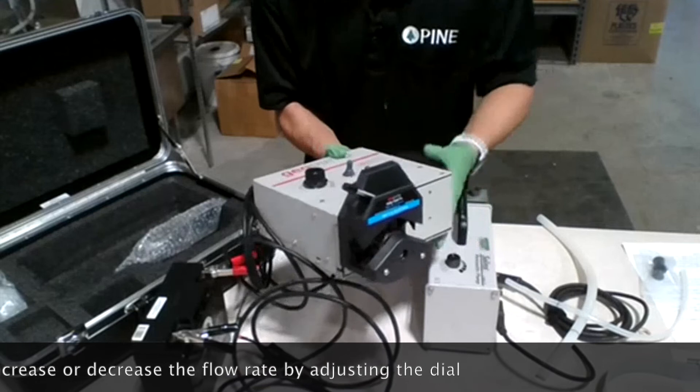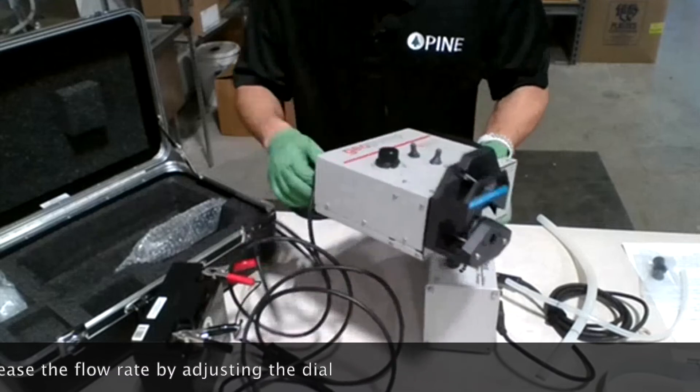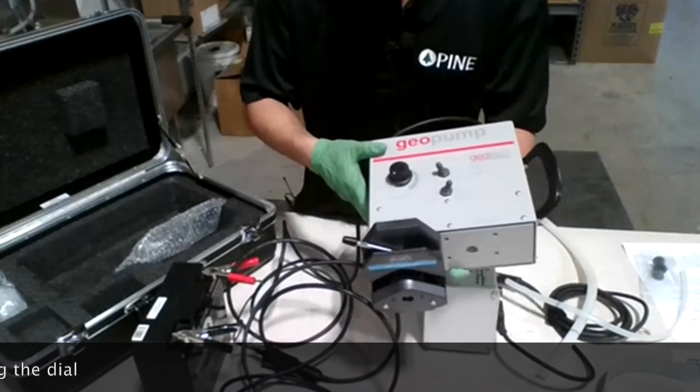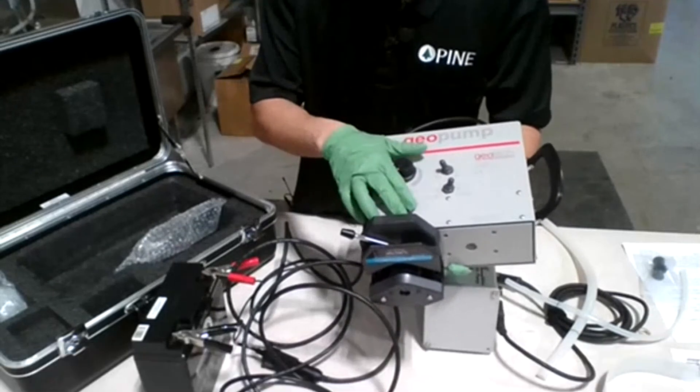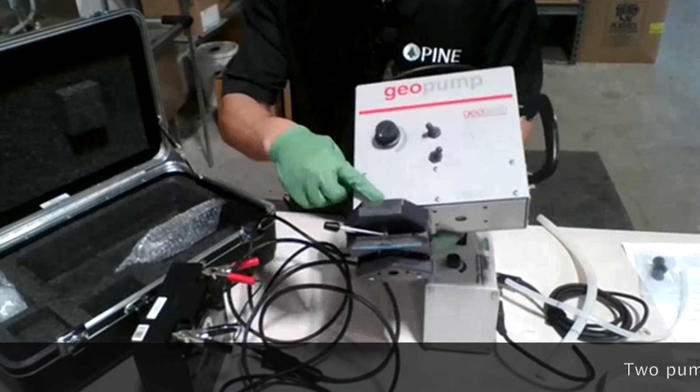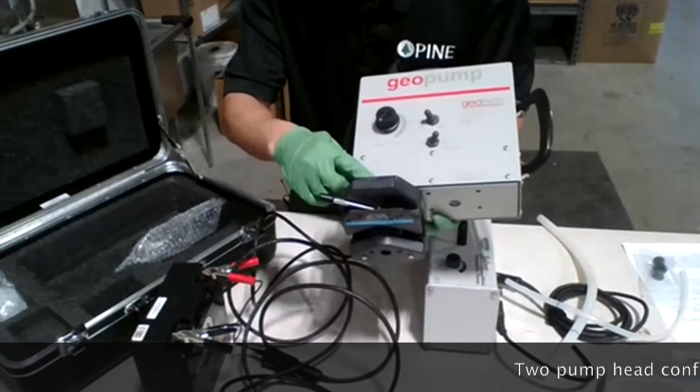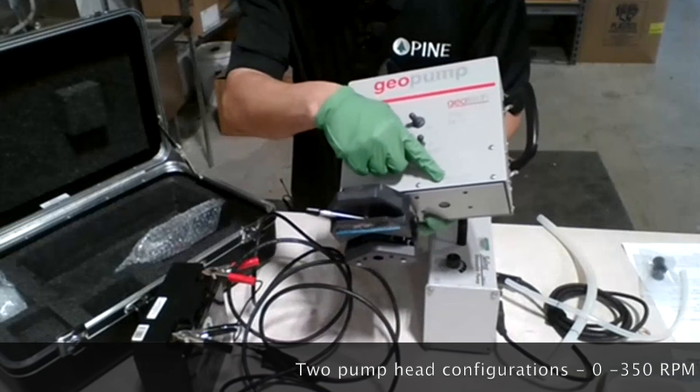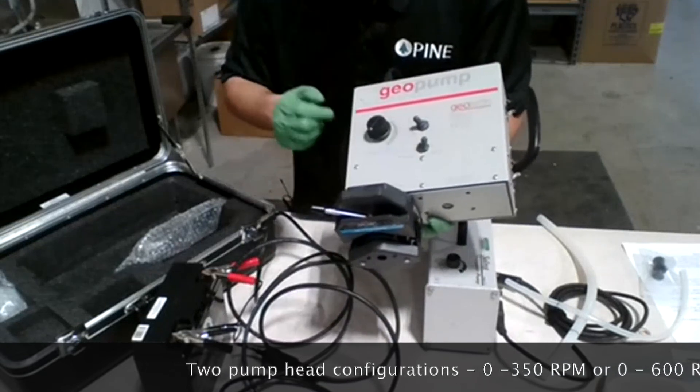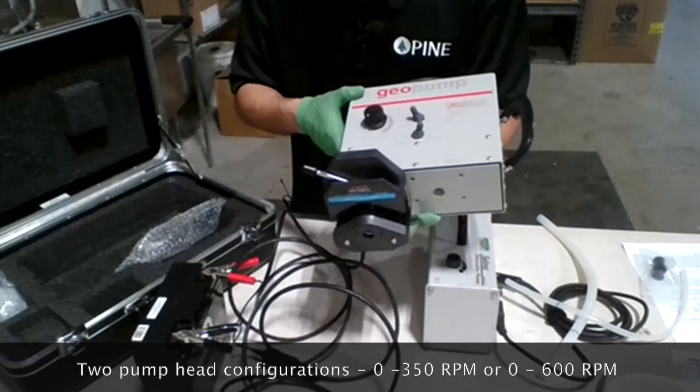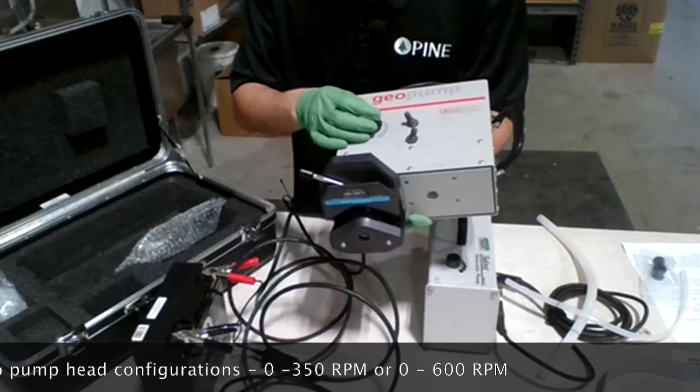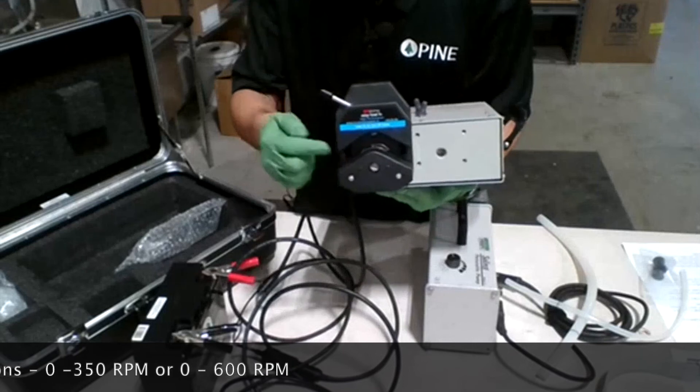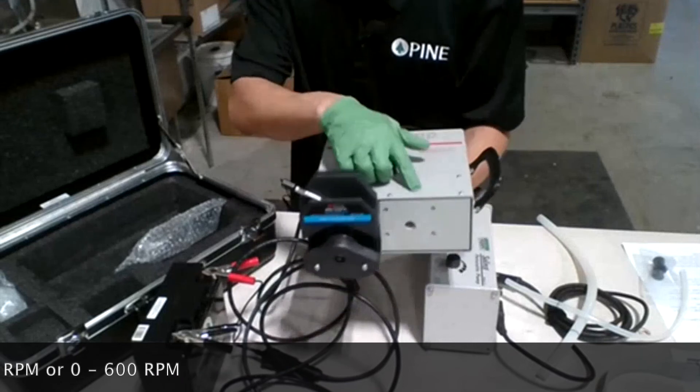I don't know if you can see from a distance here, but the pump has two pumping stations. This one that the head is attached to is zero to 350 RPM. The other one is zero to 600 RPM. If you want to swap stations from station one to the second one, you can simply do so by removing those two screws and switching it to the other side for higher RPM.